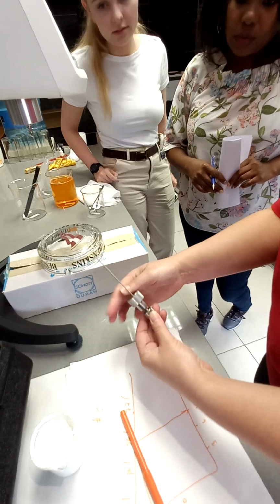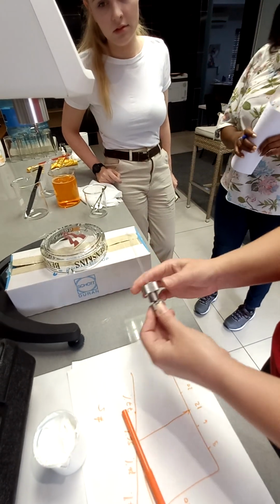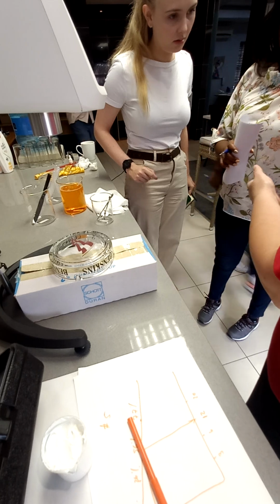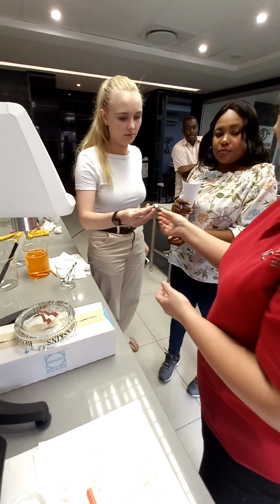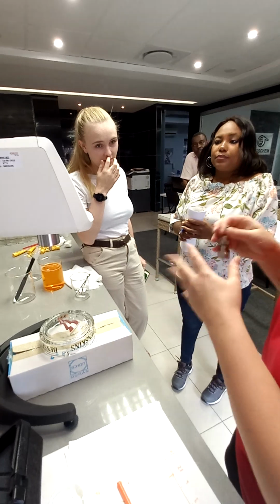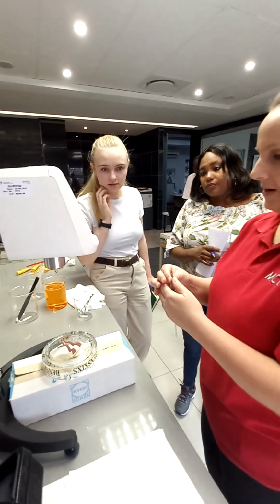And then you're just going to fasten it. And just give it a pull to see if it doesn't come out. And then feel how heavy this is. You can imagine if you had to drop that, how easily the spindle would bend. So the first few times are difficult and you'll be nervous to attach it, but once you get the hang of it, it's quite easy.